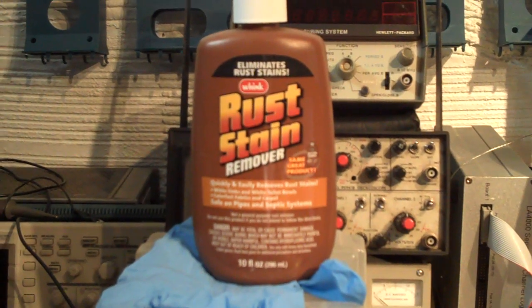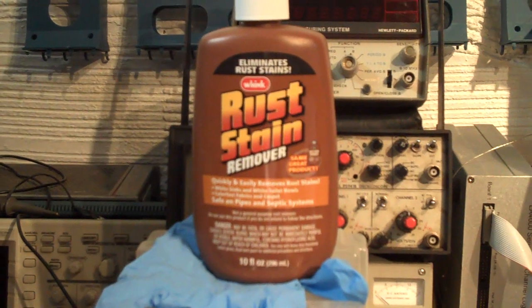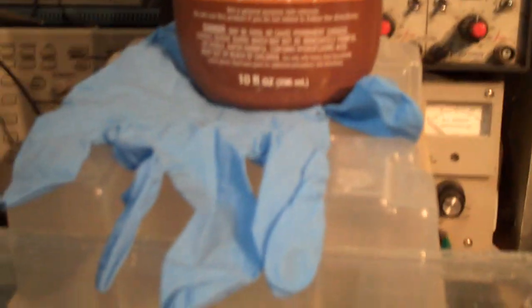Be careful. Use a splash shield and chemical-resistant goggles and gloves. Double up if you're really scared of it.